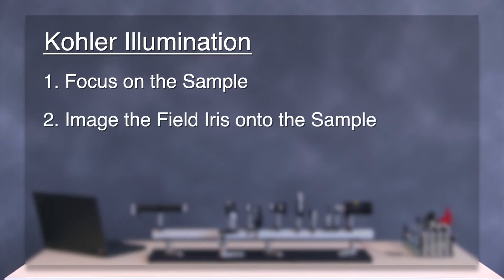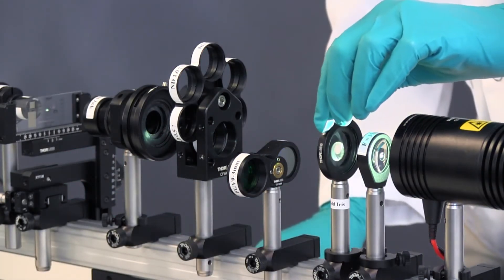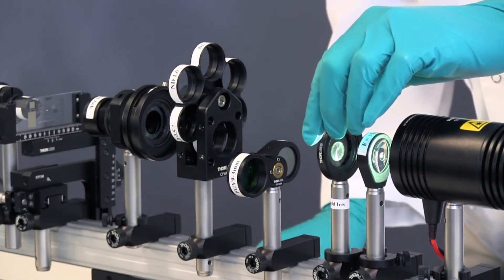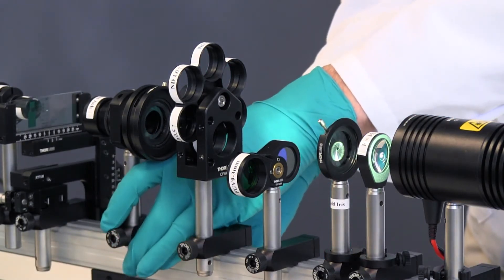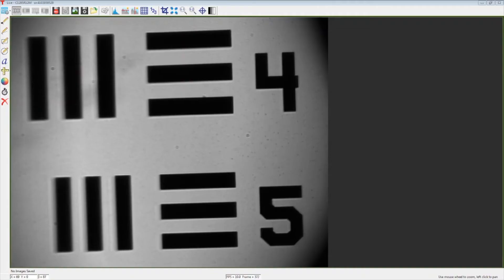The second step is to image the field iris onto the sample. Close the field iris down until the image is almost dark. Then translate the condenser back and forth until you can see the field iris in the image. Be sure the field iris is centered in the image vertically, and adjust the height if needed. Rotate the condenser until the field iris is centered horizontally, then move the condenser back and forth again until the field iris is in focus.